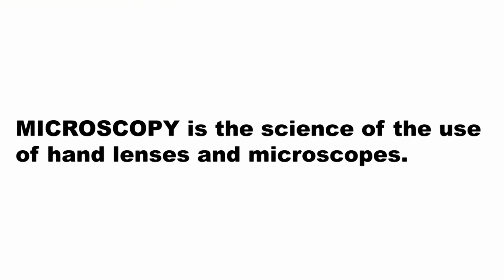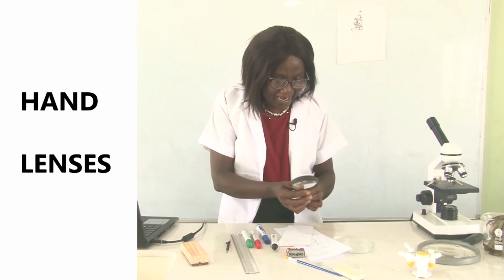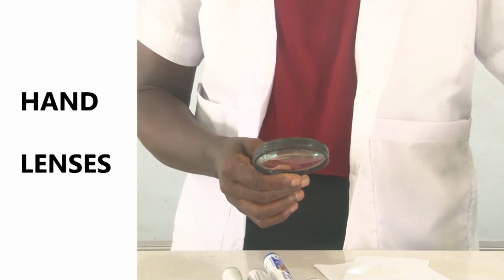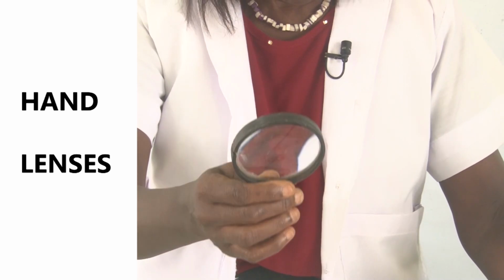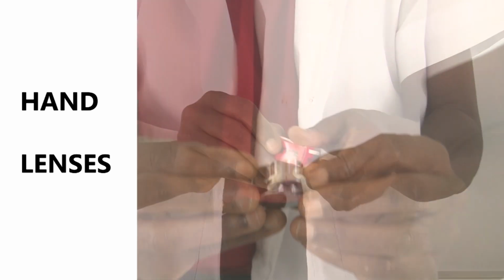So what is microscopy? Microscopy is the science of the use of hand lenses and microscopes. So let's look at hand lenses then. Hand lenses come in various sizes. You can have some as big as this. You can have some like this. You can also have some as small as this.